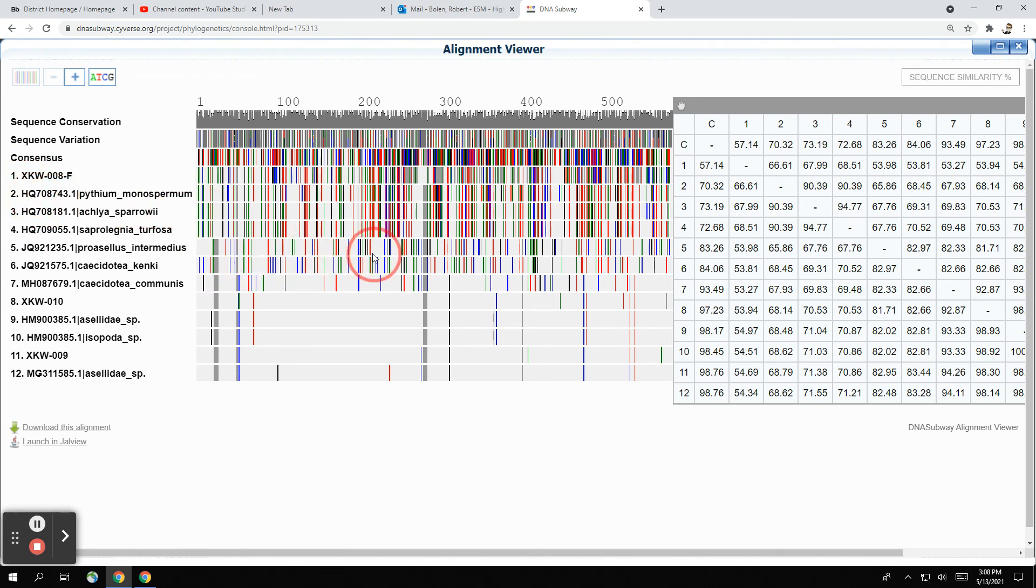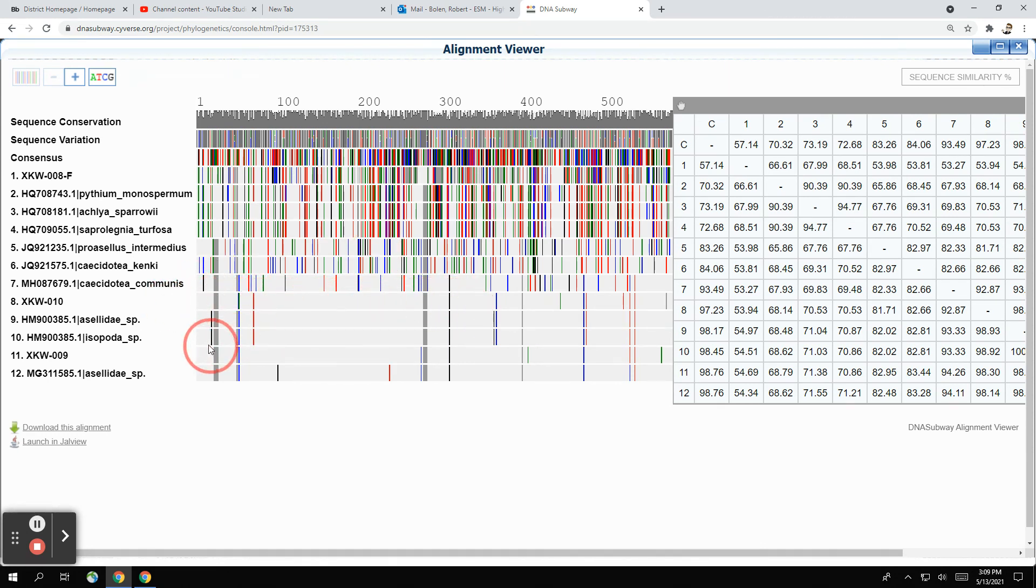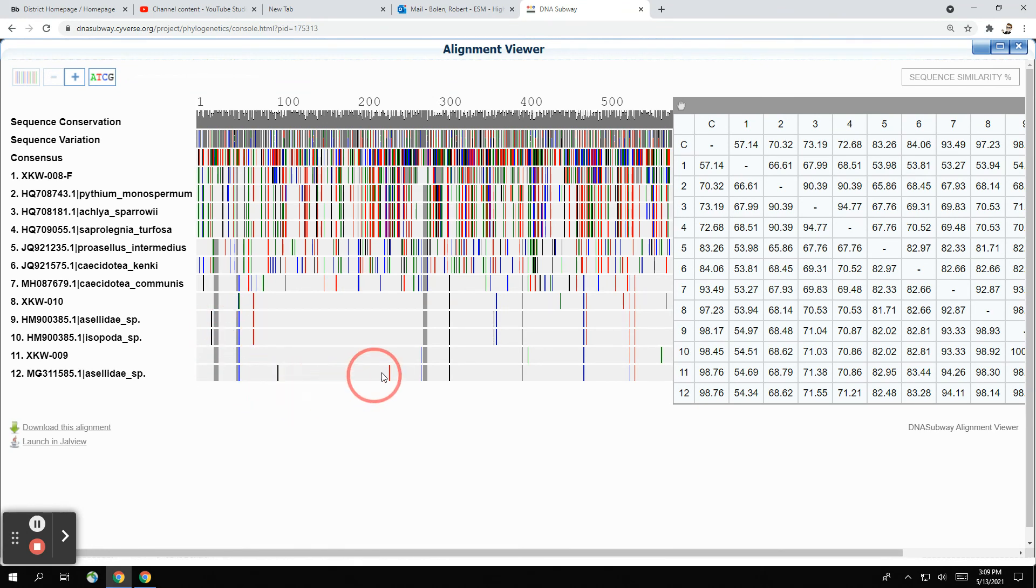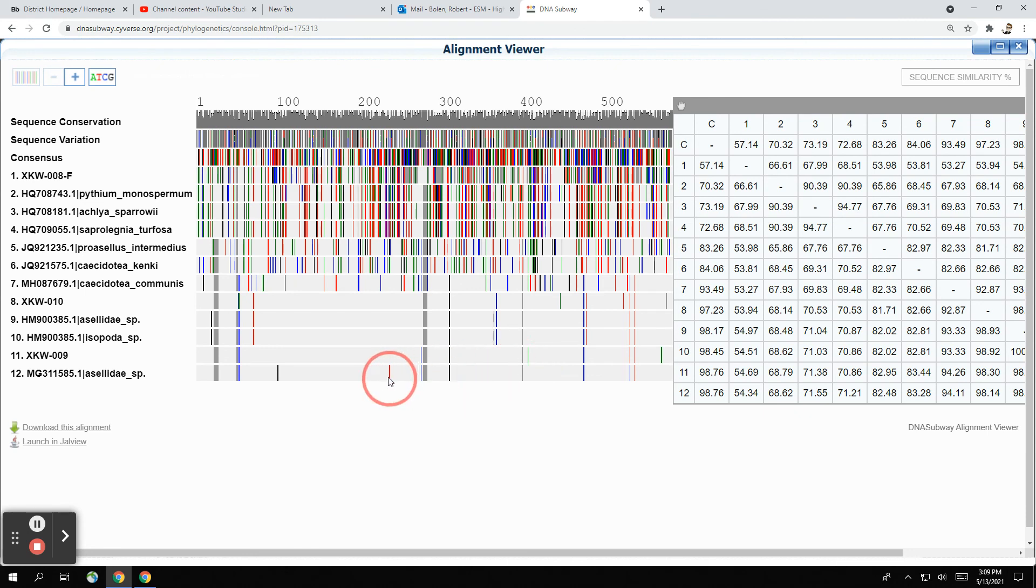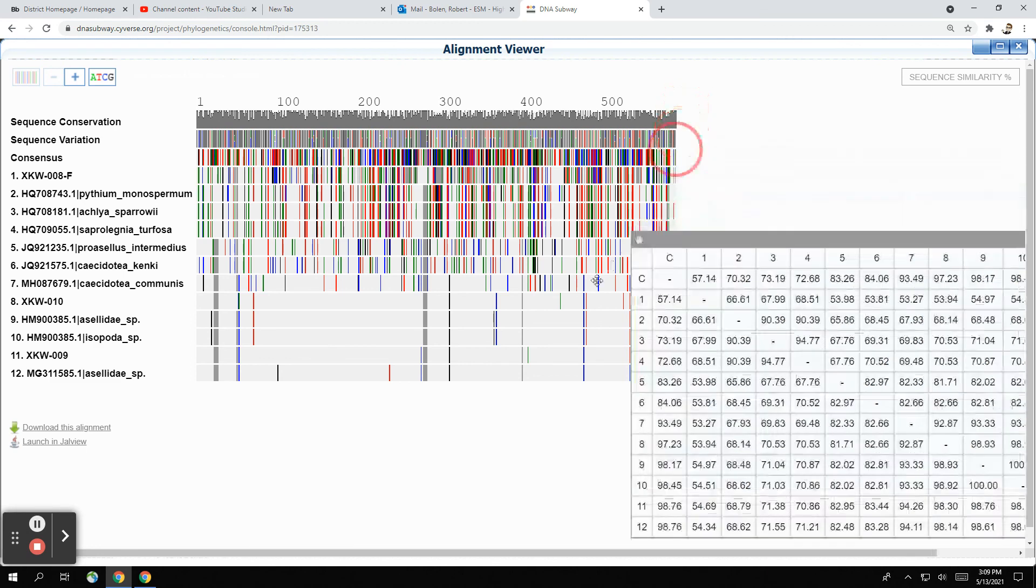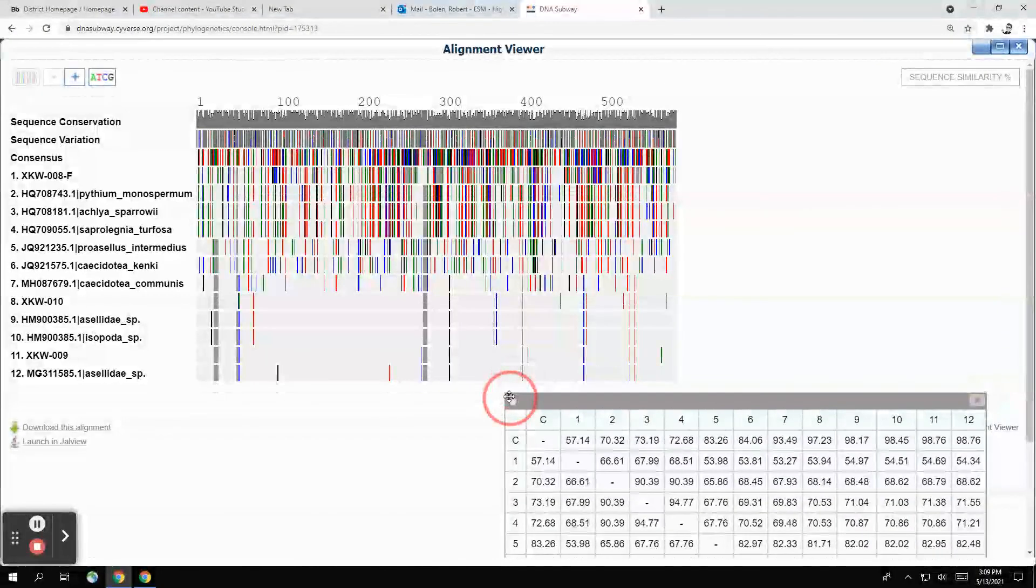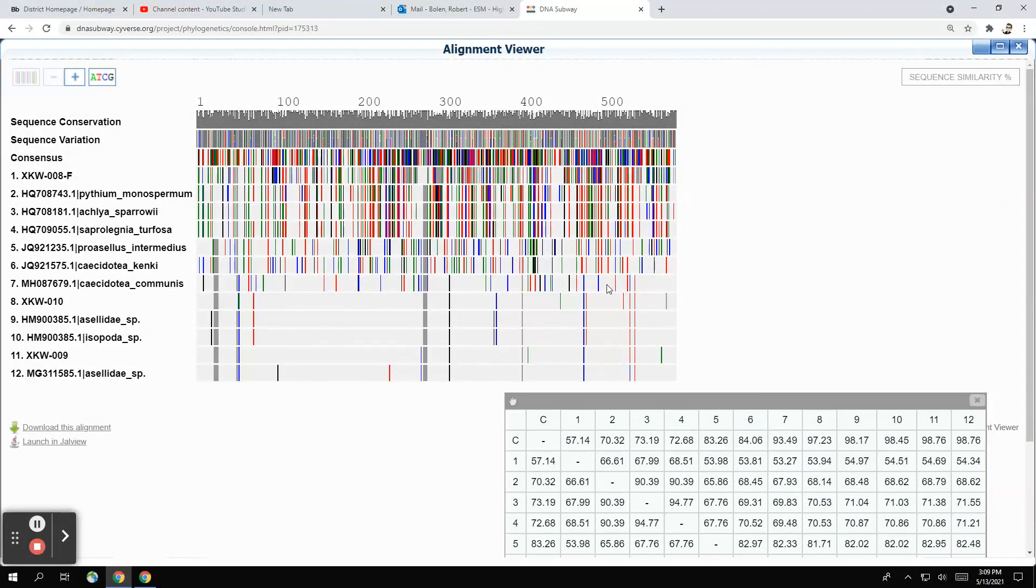When you look at these, your sequences are here. So you can see that number eight has almost an identical sequence to nine and 10. And then number 11 is really close to number 12, with the exception of a couple of little mismatches here and there, which are totally fine. It could be the result of either a mutation or just sequencing.